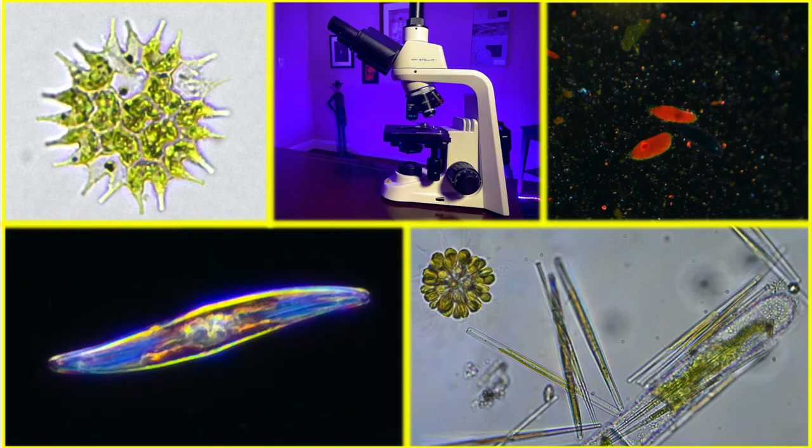This video is the first in a series on how the microscope works, how it magnifies and resolves the microscopic world for our education, enjoyment, and curiosity. This understanding will help us get the most out of our scopes and make the wisest choices if we seek to upgrade or buy accessories.